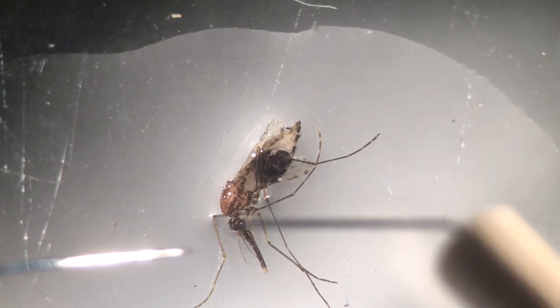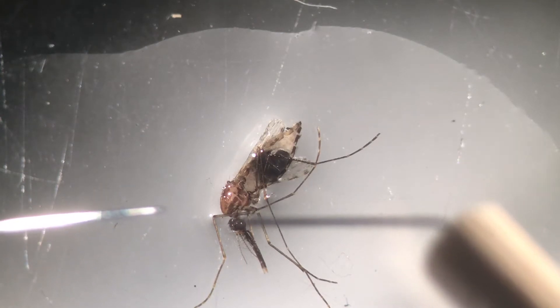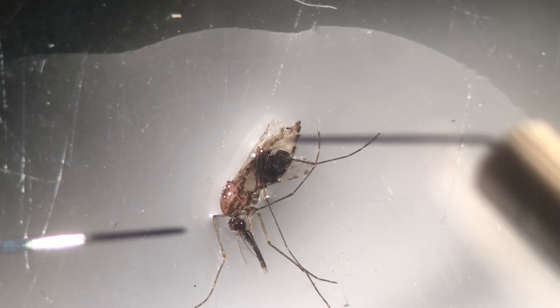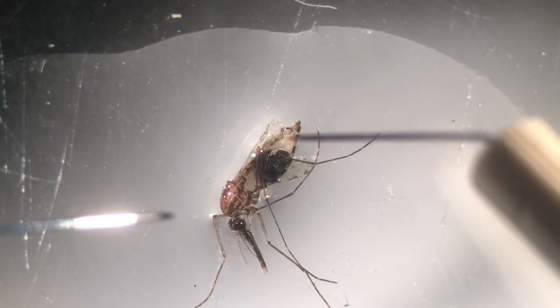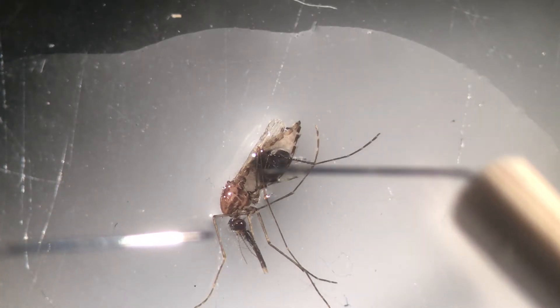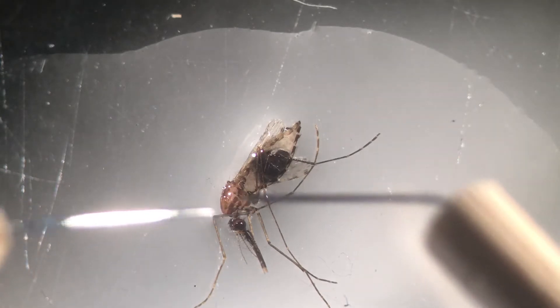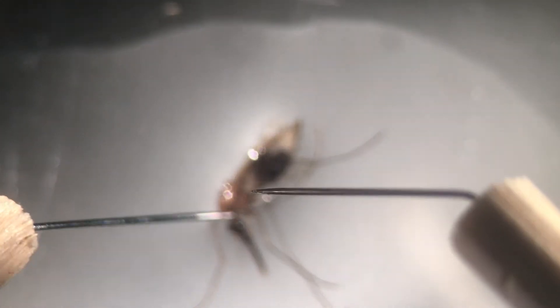To do that, we're first going to cut the head off, then we're going to cut the last two segments of the abdomen, then we're going to push the contents out, and then we'll try to dissect the salivary glands. The first thing is using our dissection needles.